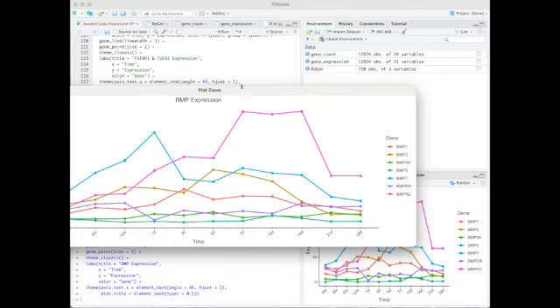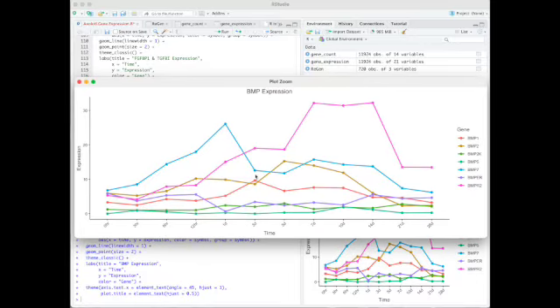They are involved in the regeneration of bone and cartilage and other tissues, as well as the regulation of cell proliferation. These expression levels vary throughout, some maintaining their levels while others fluctuate. BMP5 stays consistently low; although it is important in the BMP signaling pathway, it is not highly expressed.